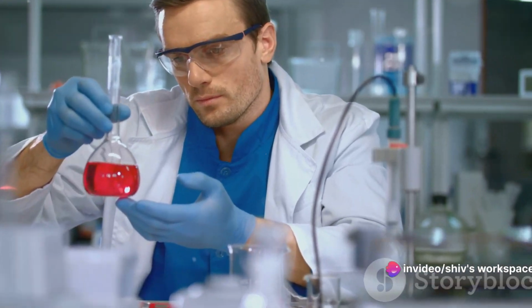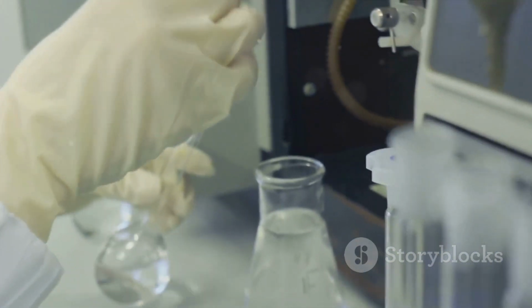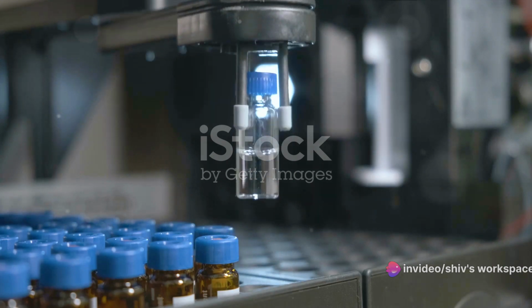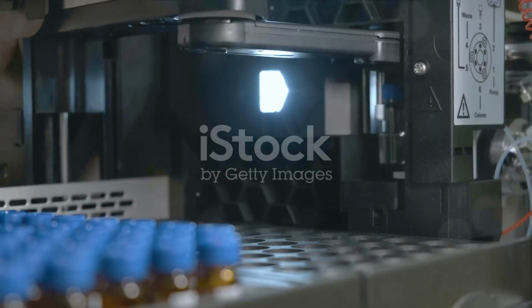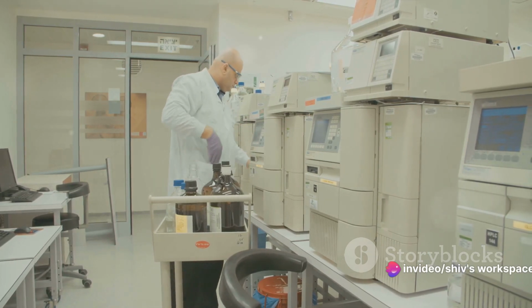And in the world of research, HPLC is indispensable for studying and understanding the complex chemical compositions of natural and synthetic materials. To summarize, high-performance liquid chromatography is a powerful and versatile tool in the world of analytical chemistry. It's constructed of several key components: the solvent reservoir, the injector, the column, and the detector. Each plays a crucial role in the process, working together to separate, identify, and quantify compounds in a sample. Its uses are wide and varied, spanning industries from pharmaceuticals to food, environmental testing to forensic science.